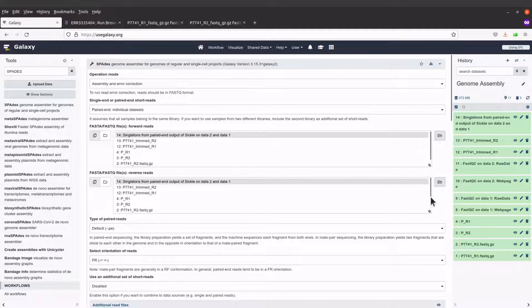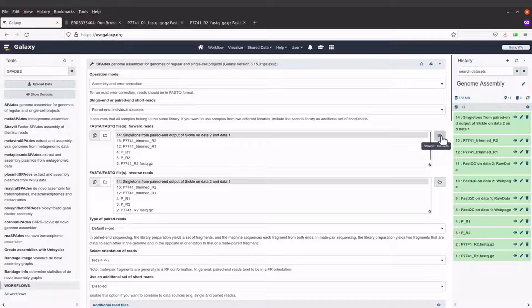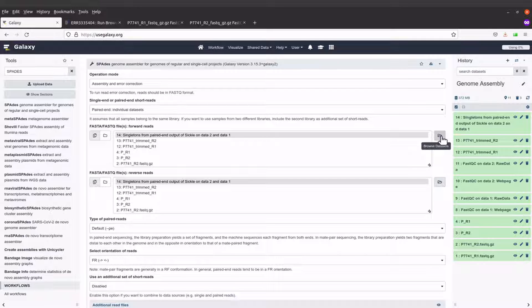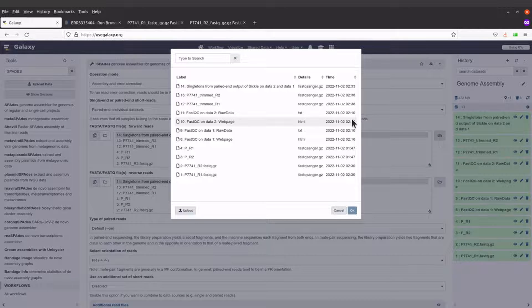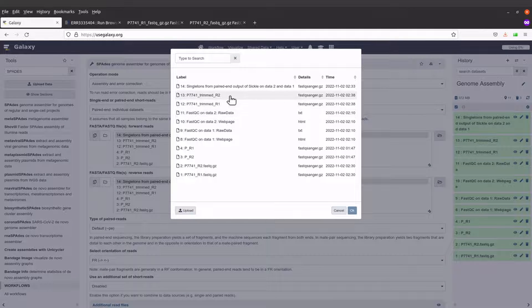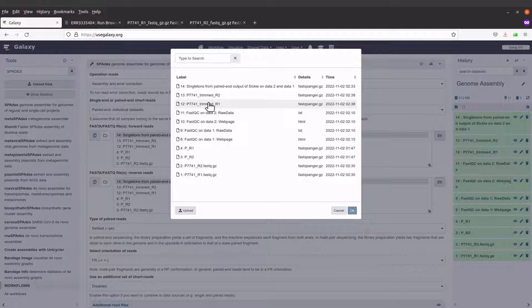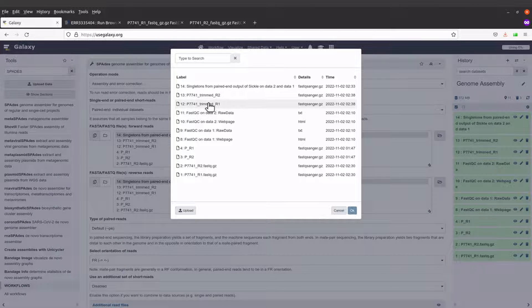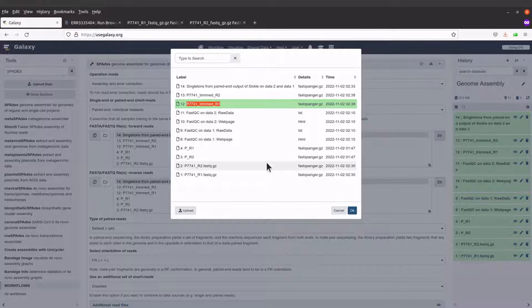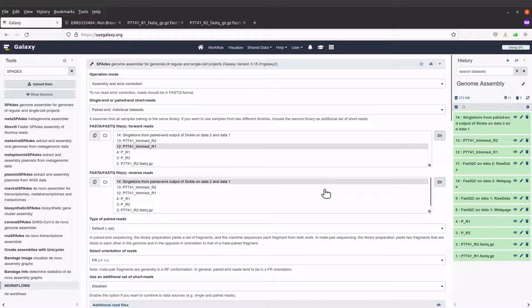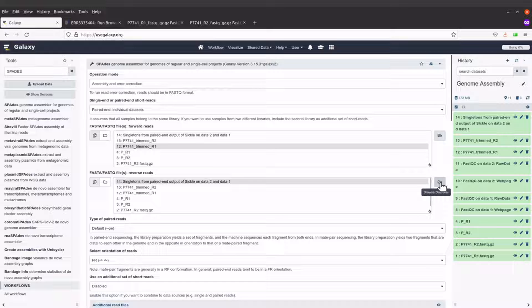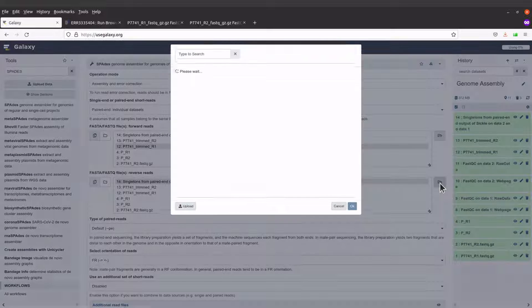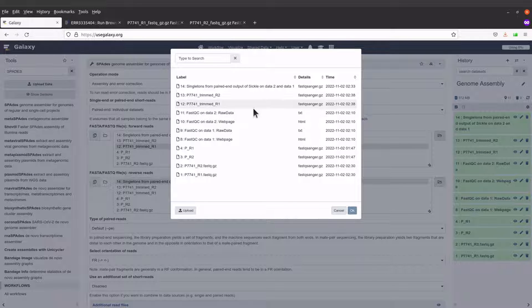I'll come to the right side here and select the browse feature to select the forward reads. I'll select just this one here, this one.